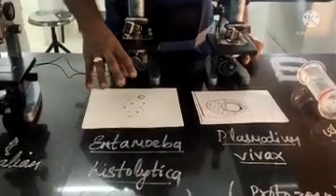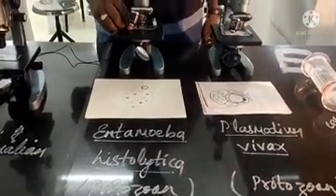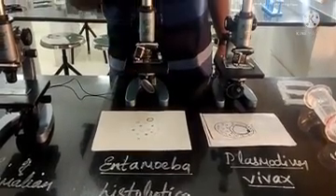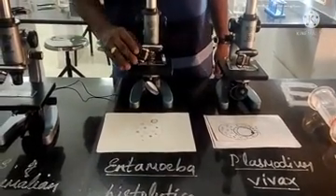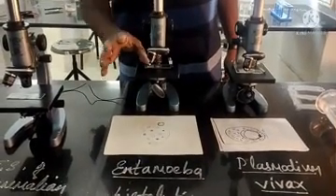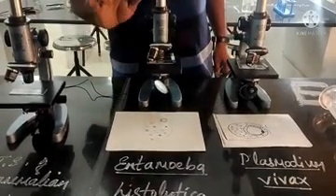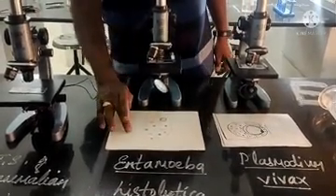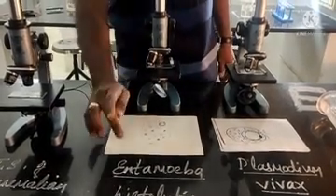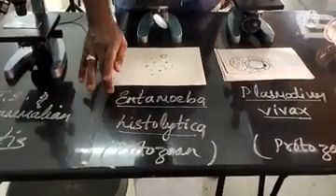Along with this Entamoeba histolytica photograph, we also have a slide. In the practical examination, 90% the external examiner will prefer the slide. Rarely they may prefer the photograph. Anyhow, all the students should be aware of both the photograph as well as the slide in order to identify Entamoeba histolytica. It causes amoebic dysentery.